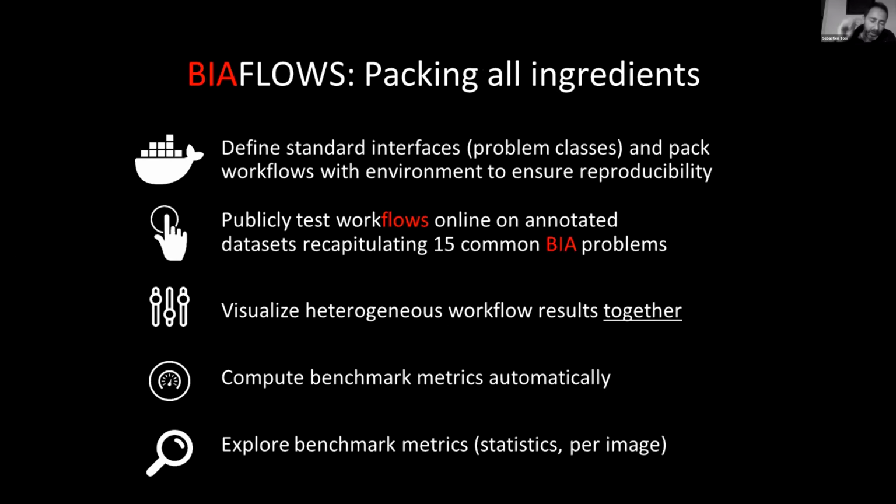So that's why we decided to develop BIAflows as a third generation way to benchmark that would be more transparent, public, and automated, and based on a web platform. So we defined a standard interface for different problem classes, such as object segmentation, object tracking, filament tracing, etc. You will see we already have many problem classes in BIAflows.